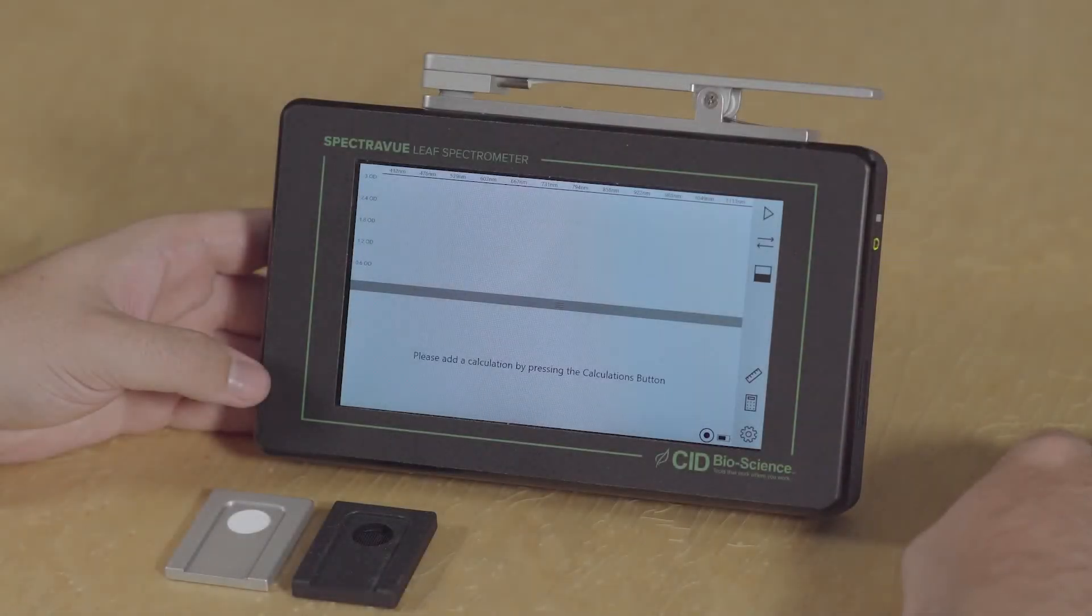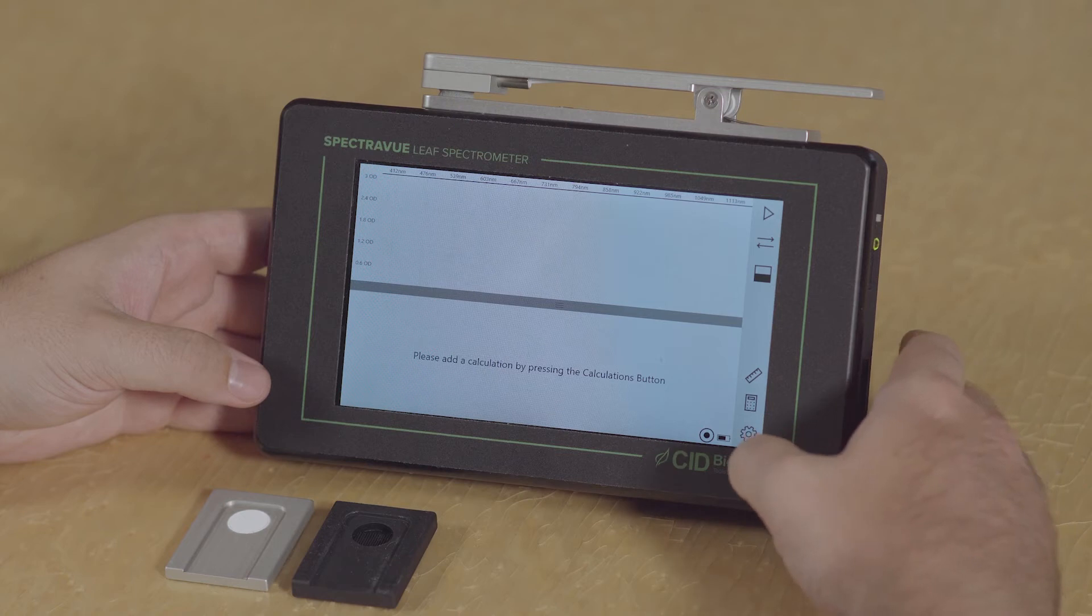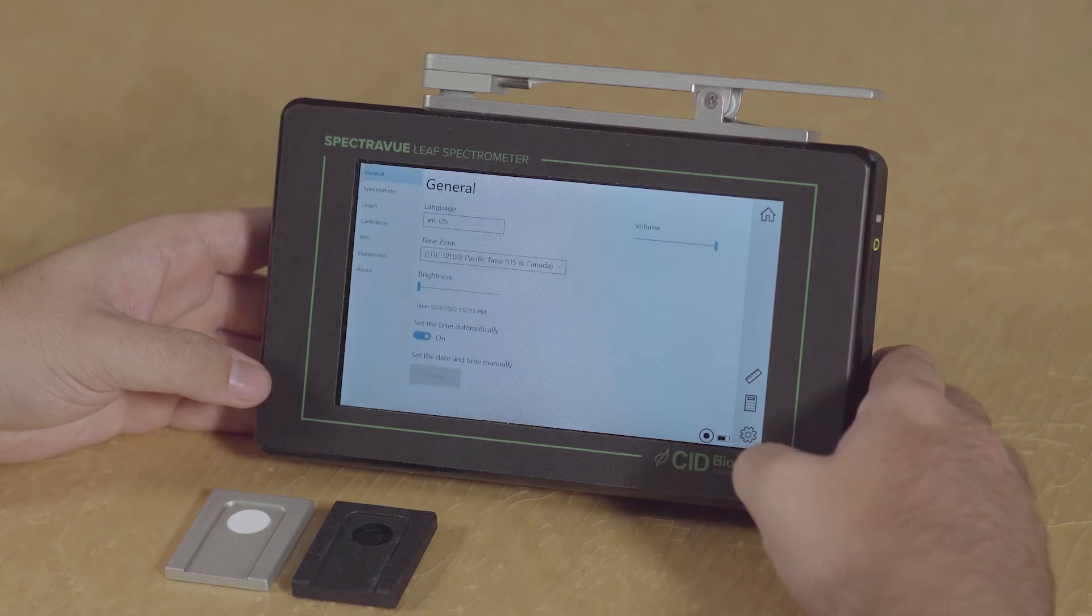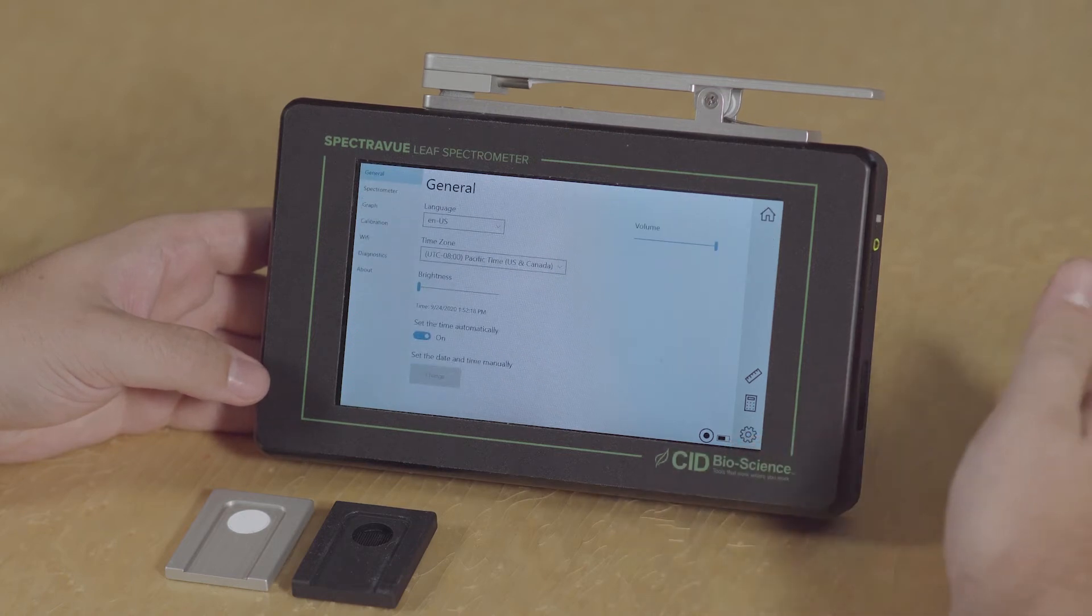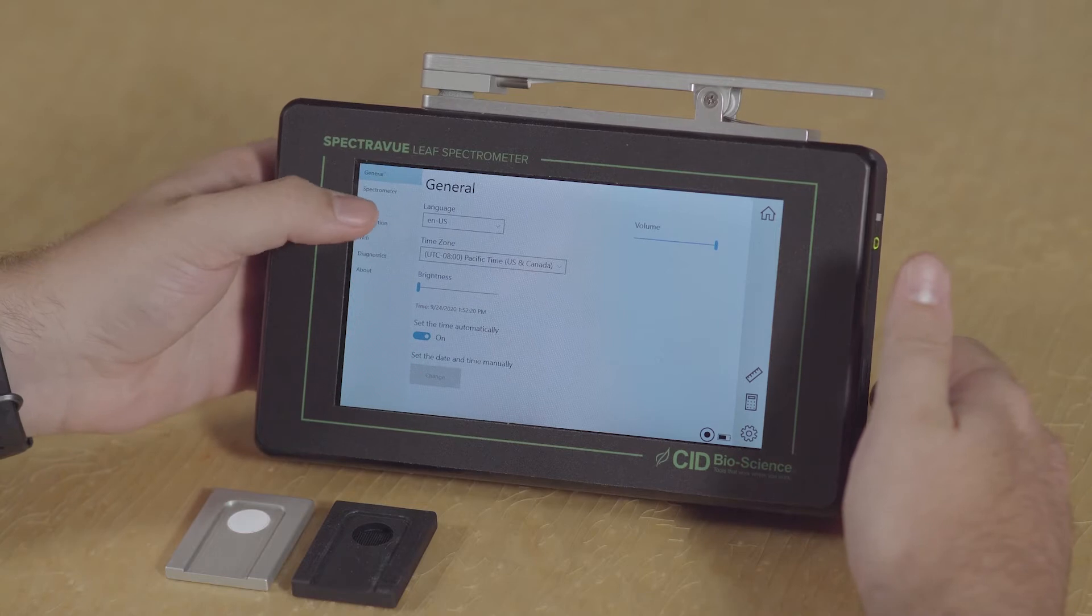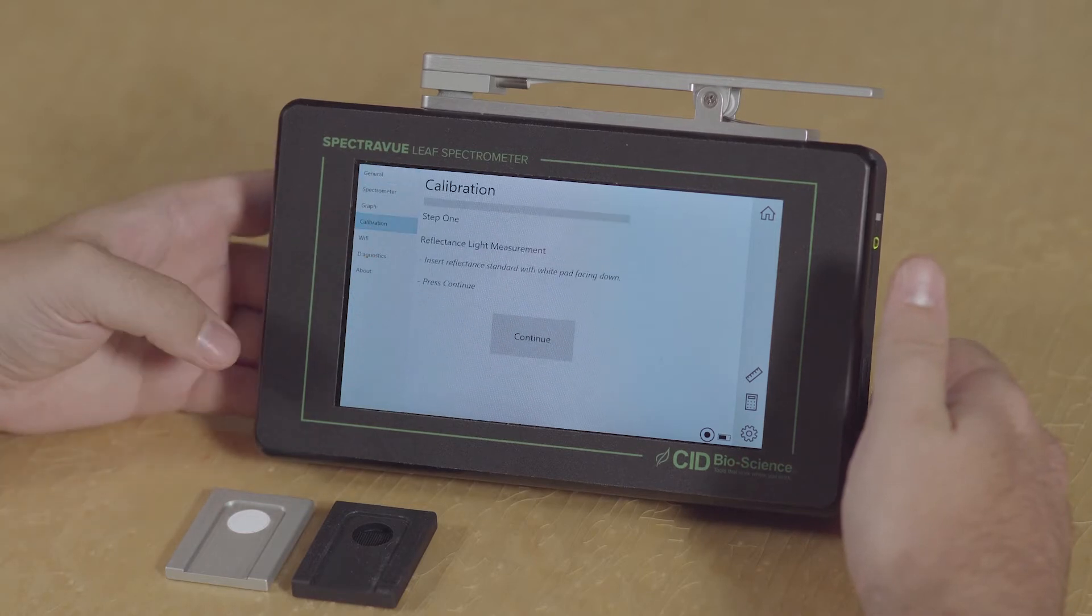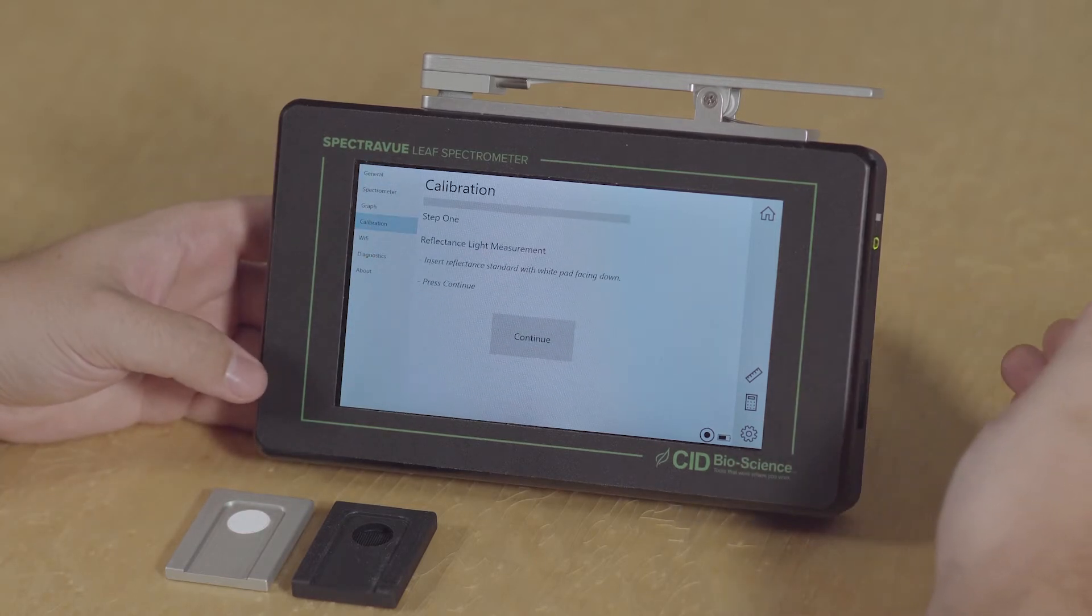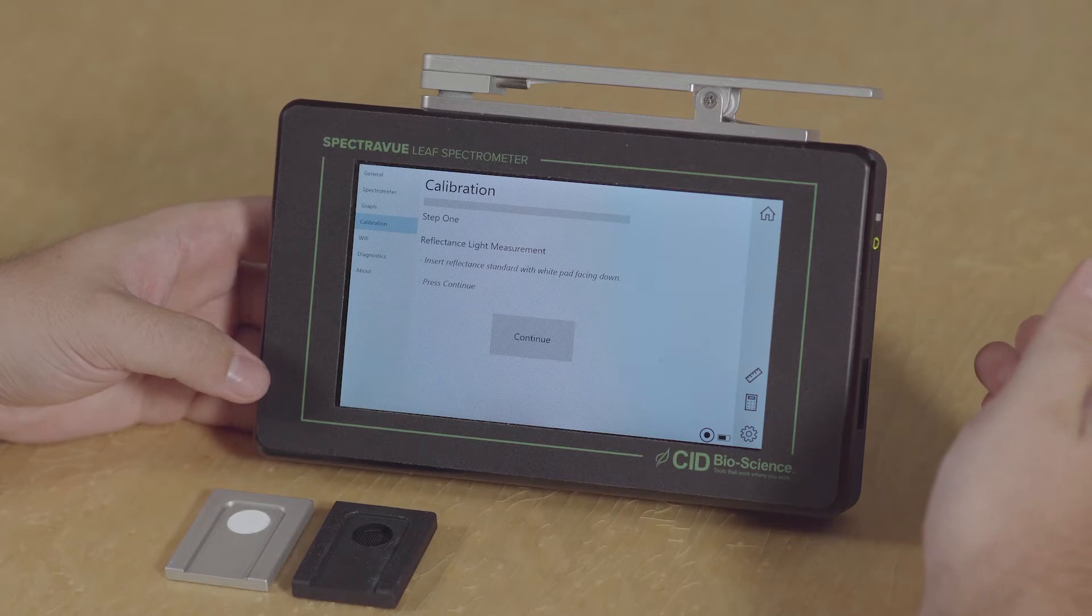To begin the calibration process, simply click the icon in the bottom right of the screen which will bring you to the options menu, and then navigate to calibration on the left-hand side. The instrument will prompt you with exact steps on how to perform the calibration.